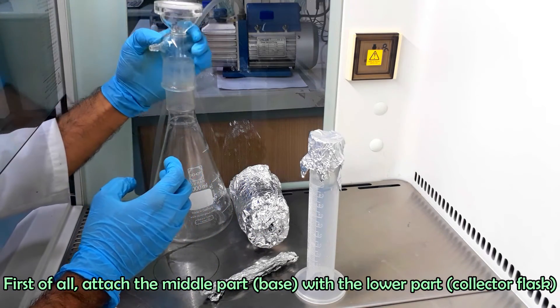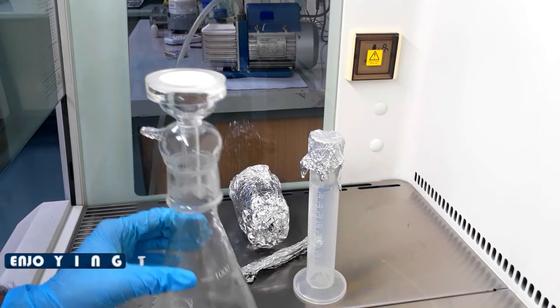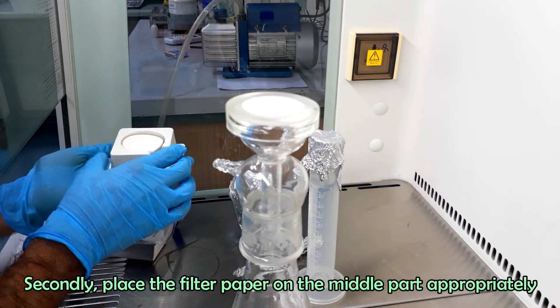First of all, attach the middle part with the lower part or collector flask. Secondly, place the filter paper on the middle part appropriately.